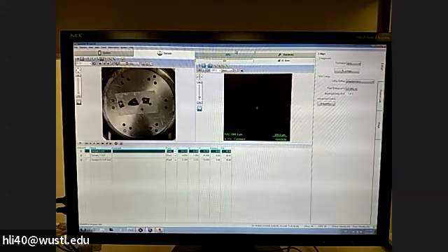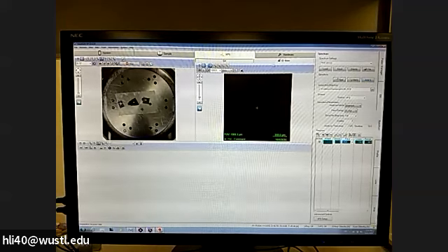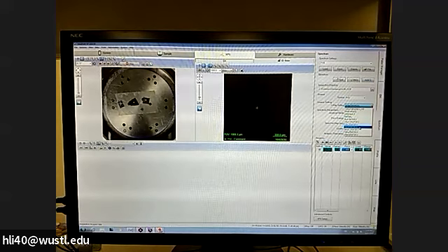All right, so let's move on. We need to do a quick survey spectrum. So we come to the XPS tab. Your source selection should be FXS, fast X-ray. For the X-ray setting, we have a long list here. It depends on what you want. Normally I recommend 100 micron for the spot size. If you have a smaller feature, you may want to go to 20 micron, but normally we use 100 micron.